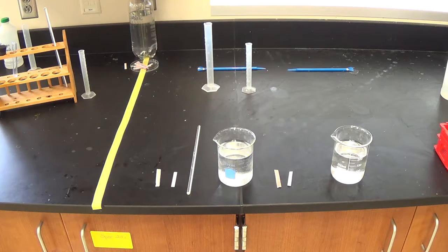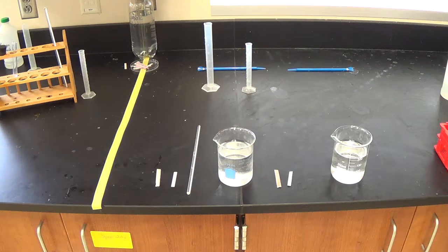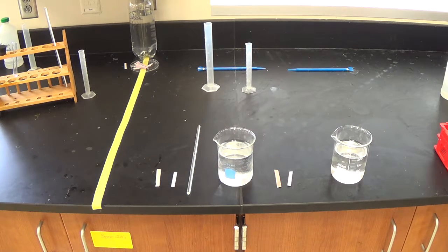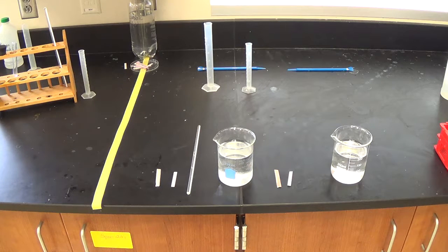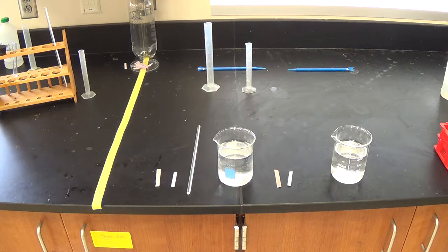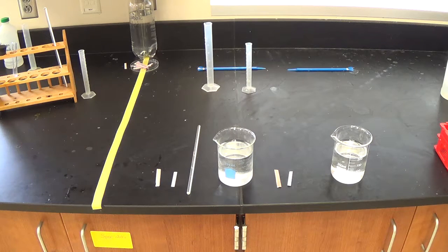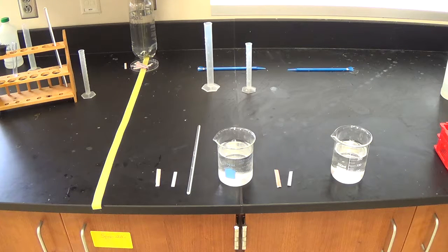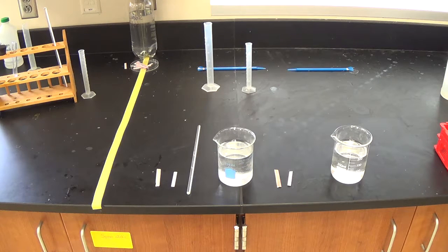Welcome to the Types of Chemical Reactions Lab video. This is to supplement what we did in the classroom. If you missed a day, you can find the reaction. If your observations weren't helpful, you can watch again and make helpful observations to determine the chemical reactions. You'll want to watch carefully as I'm going to go through all seven reactions in a matter of minutes. Listen carefully as I'm not going to put any fancy transitions. I'm going to say which reaction is which, and you have to pick it up from there.